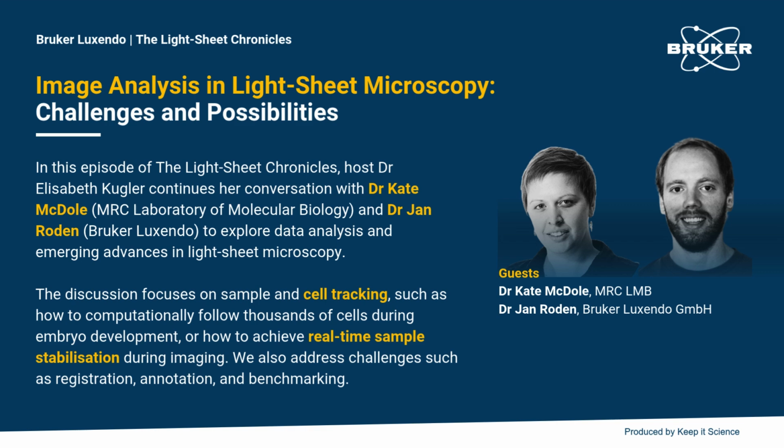And in some cases, there are data sets where we just can't register them. There's just not enough information, or the sample is so large and hollow in the middle that there's just no way to register it. And so then you just kind of have to cut your losses and take the best of each side, and get rid of the information in the middle where the image quality is not any good.